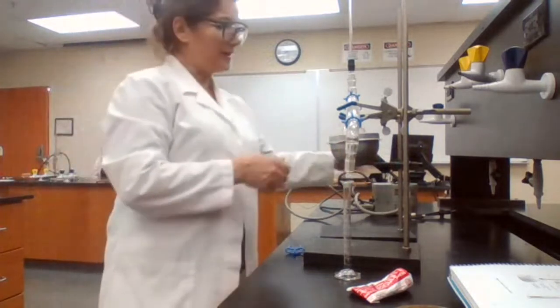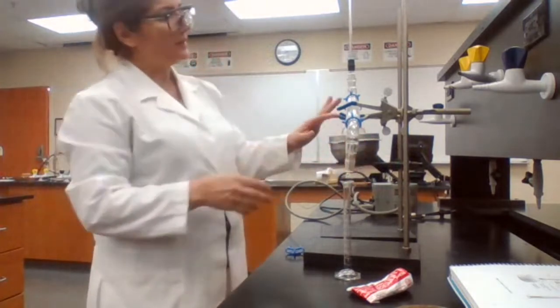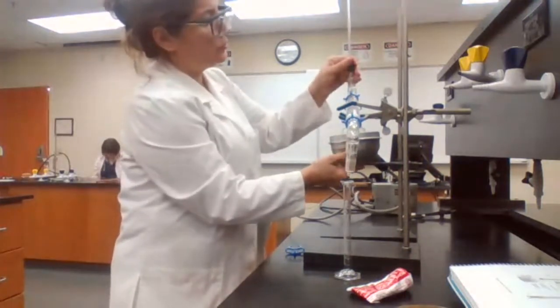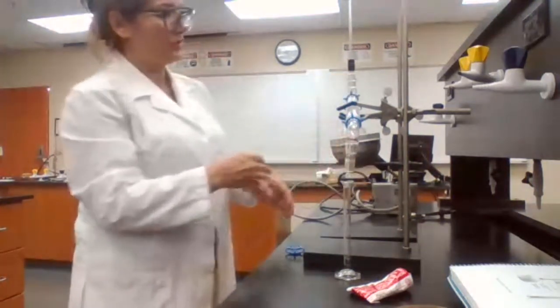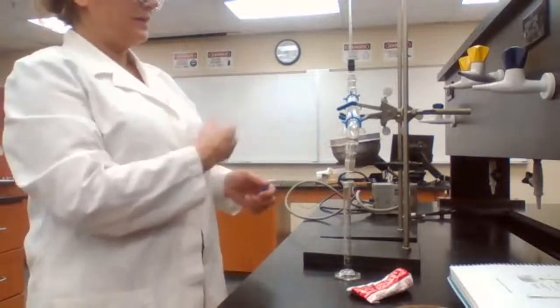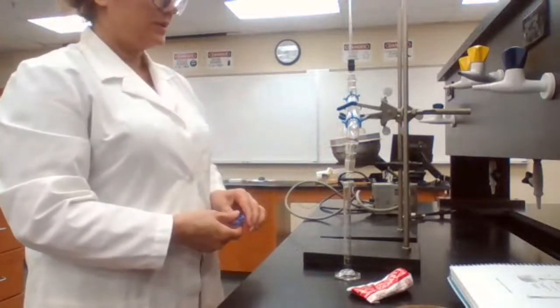Because if I turn that off, this is still hot, and you cannot distill to dryness. So you have to make sure that when you stop distillation, the heat is actually removed.